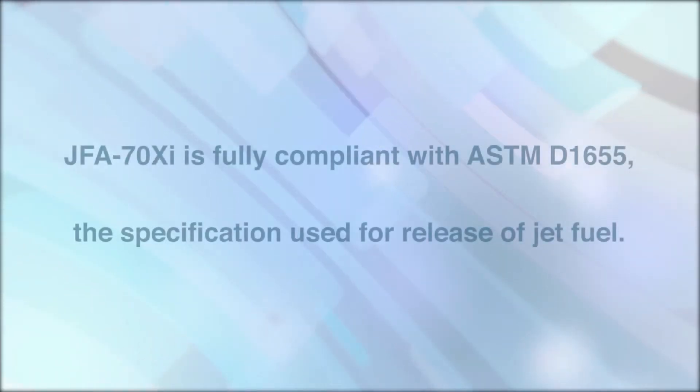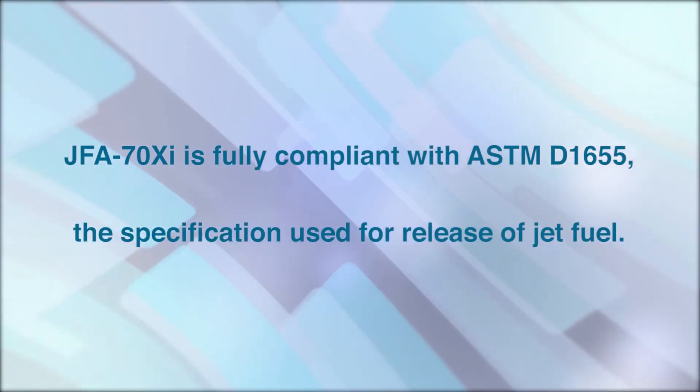Fully compliant with ASTM D1655, the specification used for the release of jet fuel.